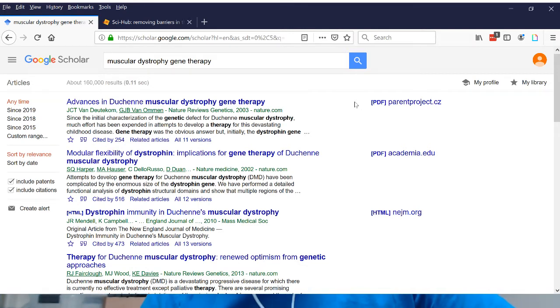The next step is you need to figure out the gene sequence of what you want. So say I want to insert a gene for, I don't know, what are people into these days?